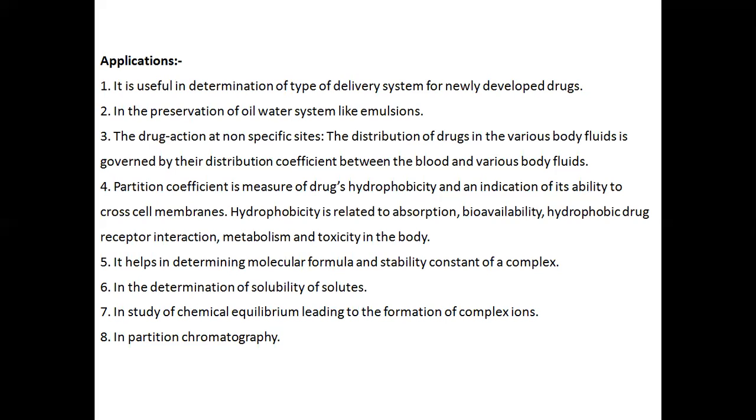Partition coefficient is a measure of drug's hydrophobicity and an indication of its ability to cross cell membranes. Hydrophobicity is related to absorption, bioavailability, hydrophobic drug receptor interaction, metabolism, and toxicity in the body.